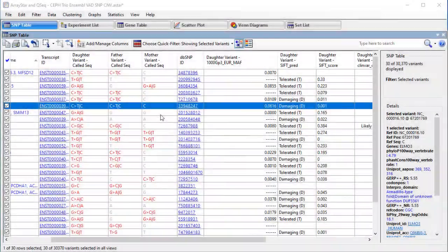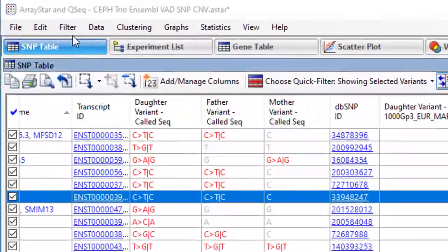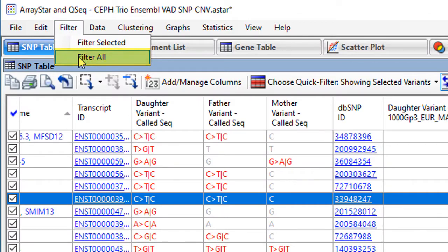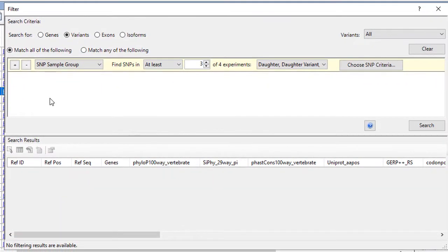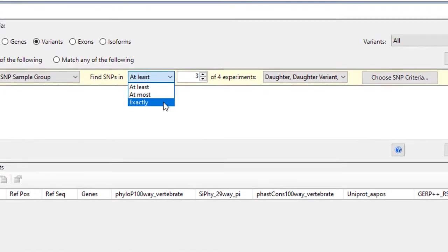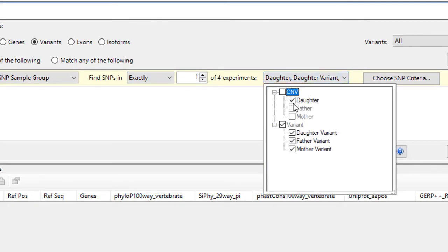To filter variants and create sets, go to Filter, Filter All, then specify your search criteria. For example, let's say we want to find non-synonymous SNPs that are predicted to be damaging in the daughter. We'll change the criteria to look for SNPs in exactly one experiment, the daughter.